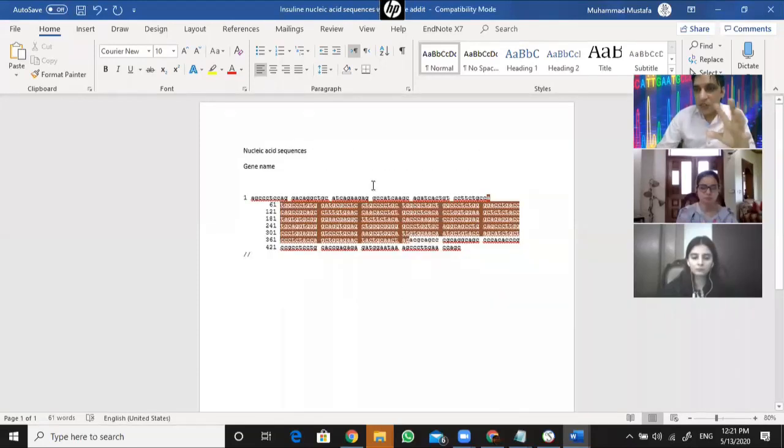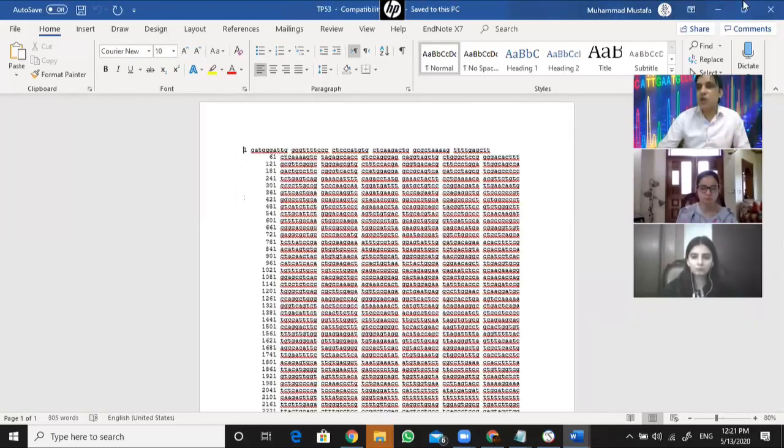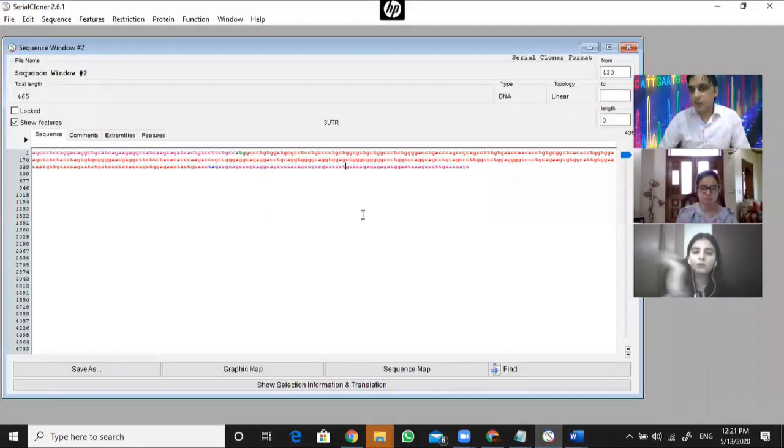If you want to search the sequence in Microsoft Word, every space will cause it trouble. These numbers will cause it trouble. Enter will cause it trouble to search a space, but these things will not cause any trouble here in that sequence. You can search it right away.